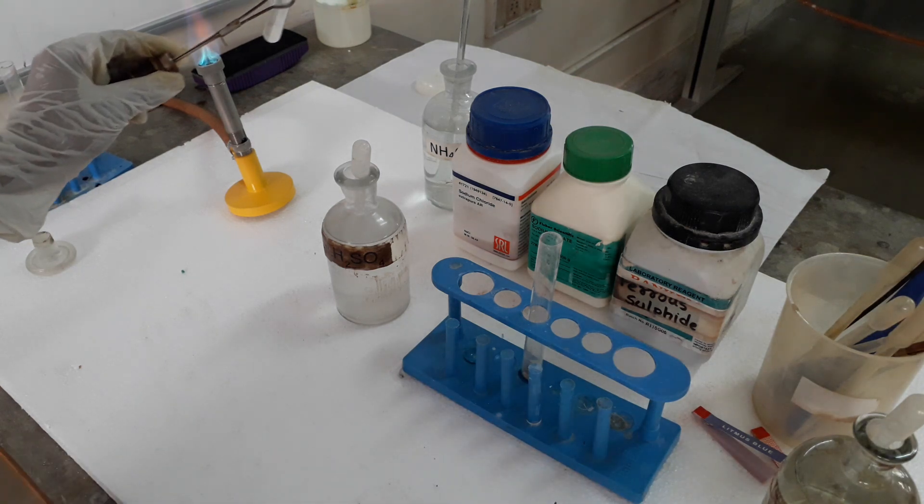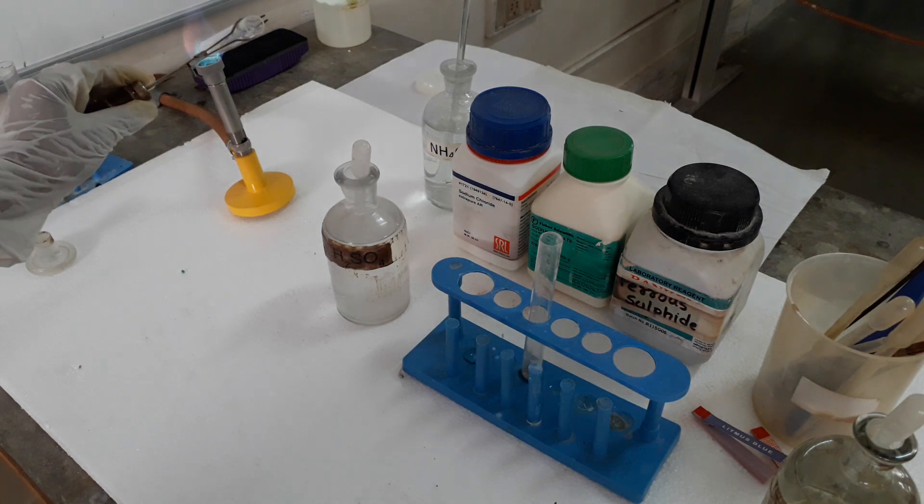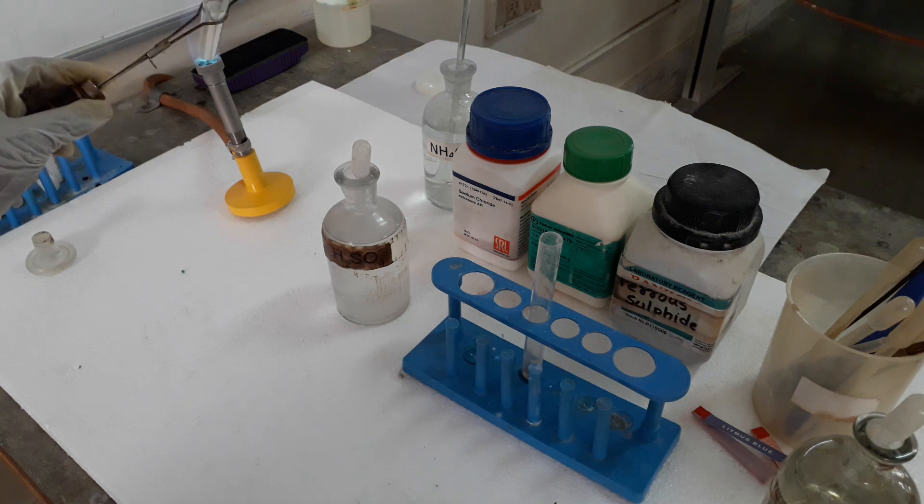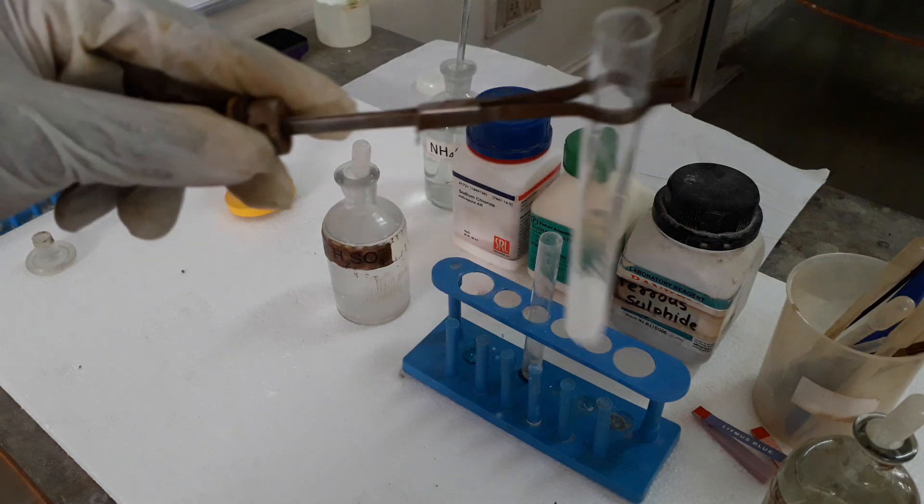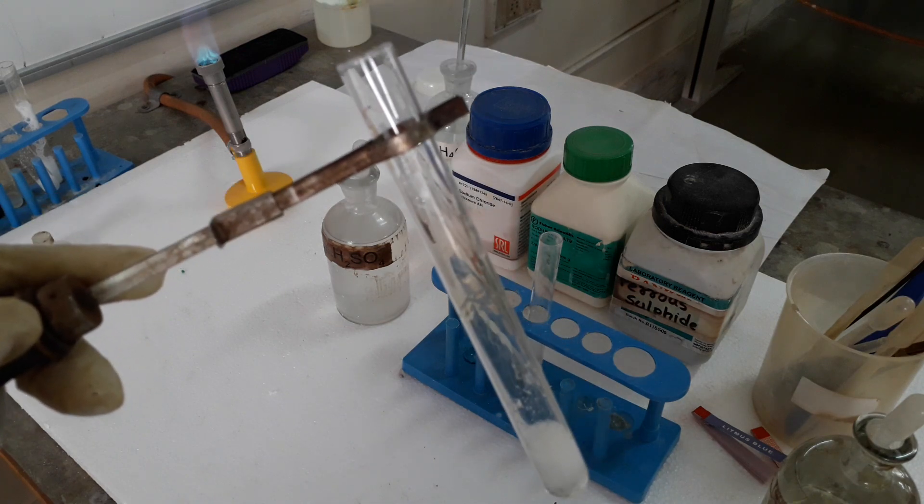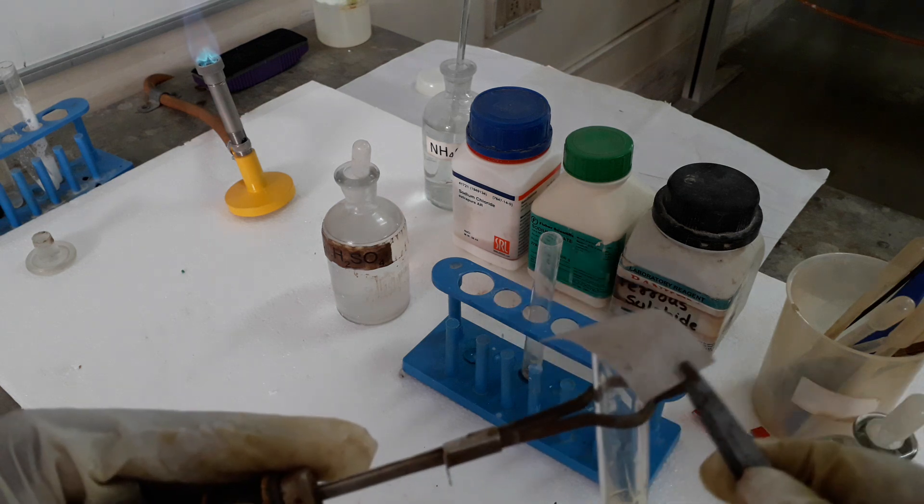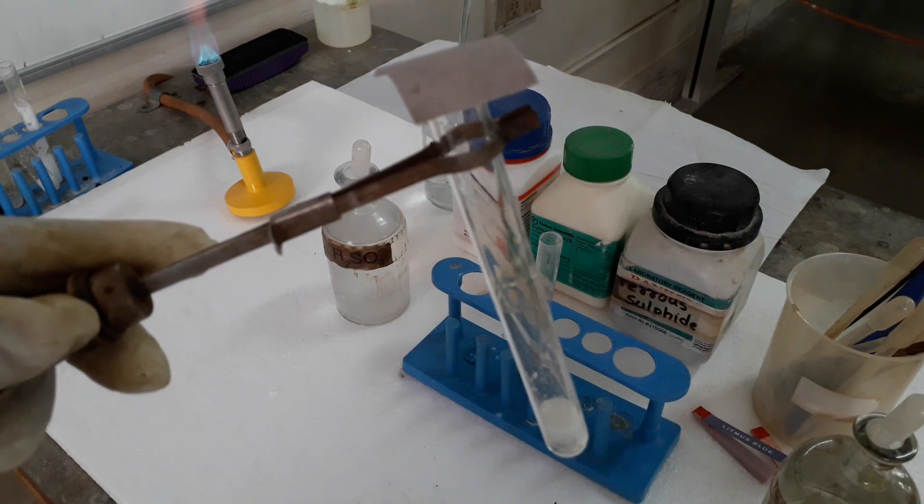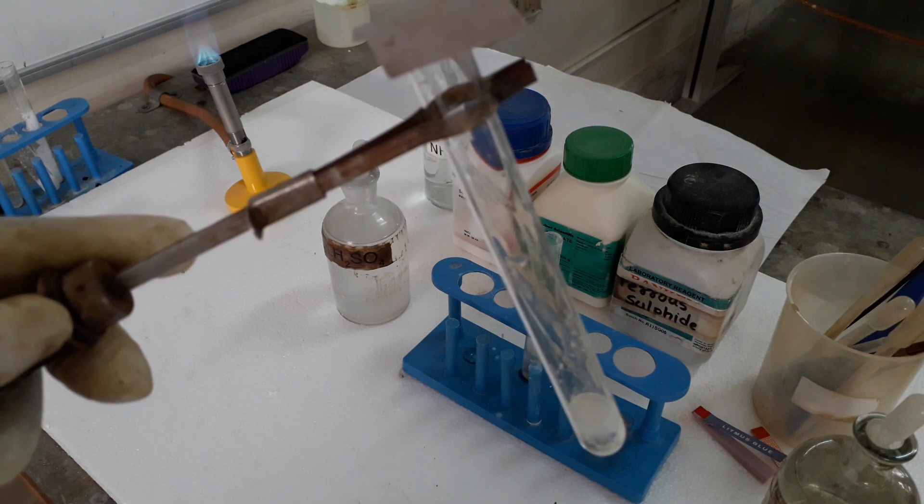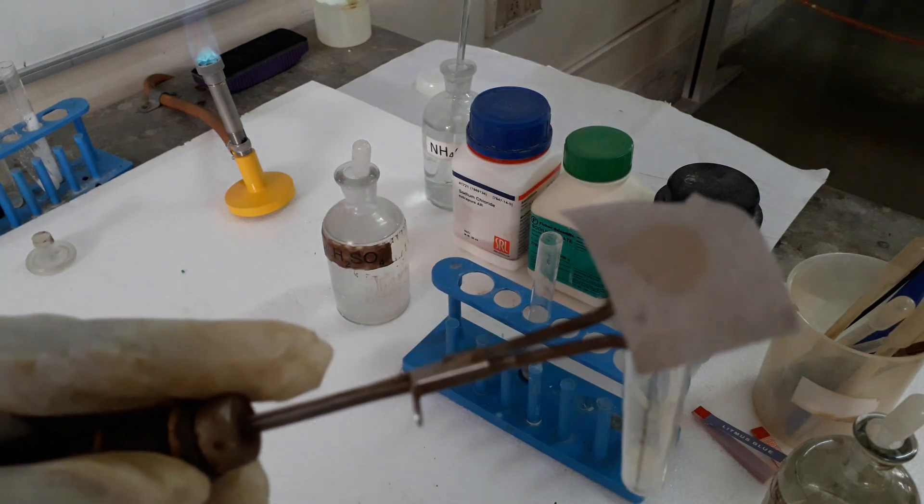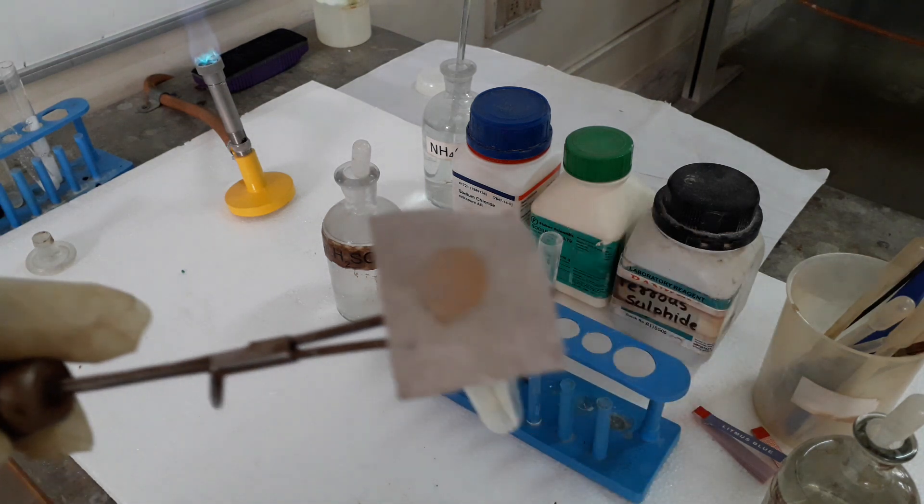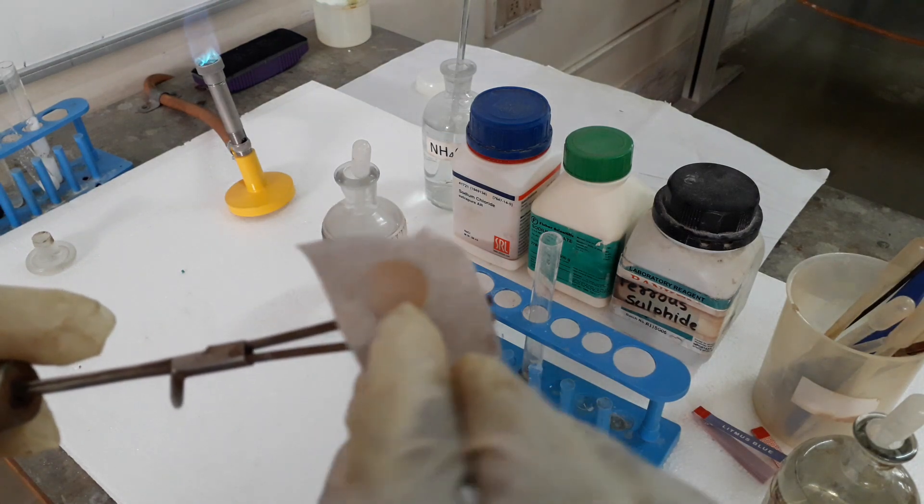We will bring filter paper dipped in KI solution. The potassium iodide solution turns brown. KI paper turns brown. After some time, reddish brown fumes will start coming out. You can see here KI paper has turned brown in the center. Nicely we can see it here, beautifully turning brown.